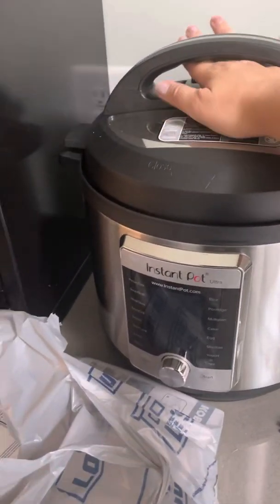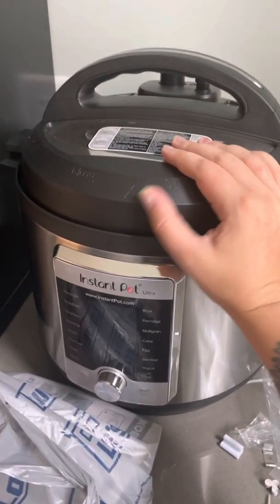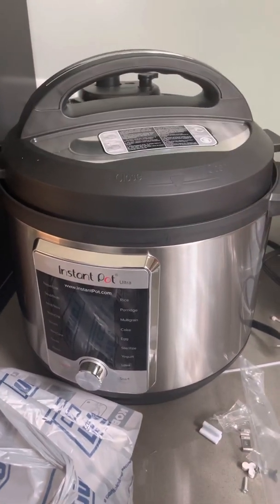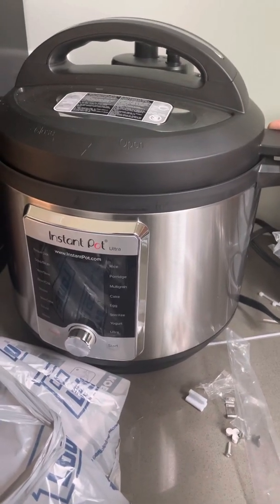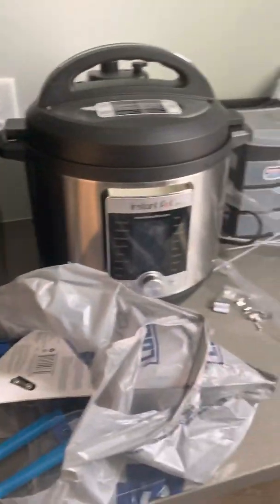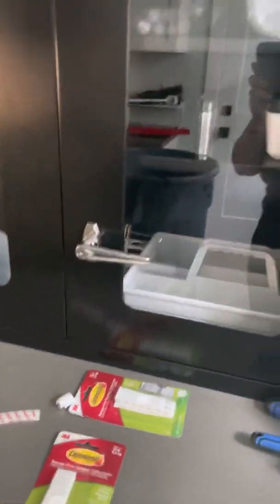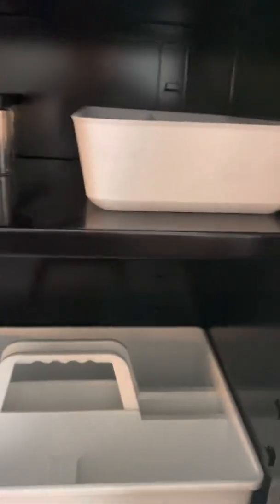Here's some storage, and this is a pressure cooker — and no, I'm not using it to cook things. This is for sterilization. Instead of getting an autoclave, which some of you nerds might know — it basically steam sterilizes things. This is for algae, since algae is unicellular and it's really easy to get contaminated. It really matters if it's contaminated with another algae species or bacteria, so these sterilize any equipment I'm going to use for sterile algae cultures.